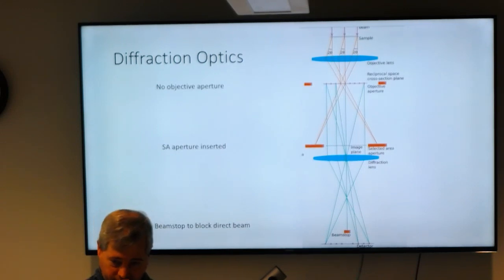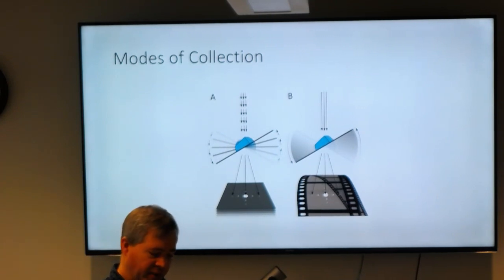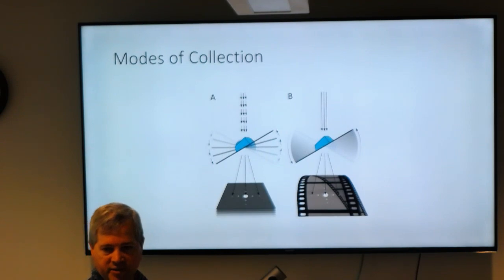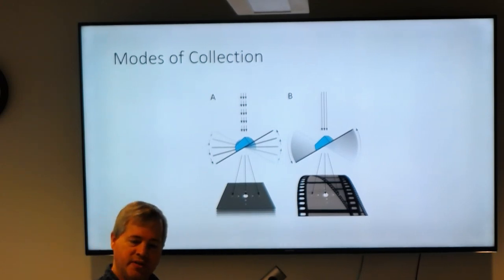And how do you need to set up? Do you need to set up your microscope in a special way? Yeah, to set up your microscope, you should put in a carbon grid, or actually a cross-grating grid would be good because it's got a little bit of gold sputtered on it. You could look at it in diffraction mode and make sure the rings are round and not oval, because if the diffraction astigmatism is off, you would get ovals. So you make sure that the diffraction pattern is perfectly round. And make sure that when you go to diffraction, the diffraction beam is right in the middle, and not off in some funny place.